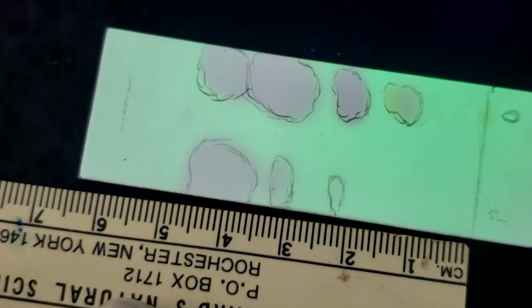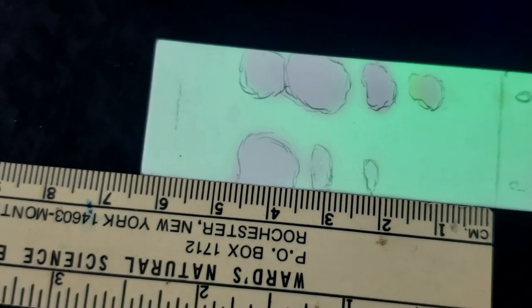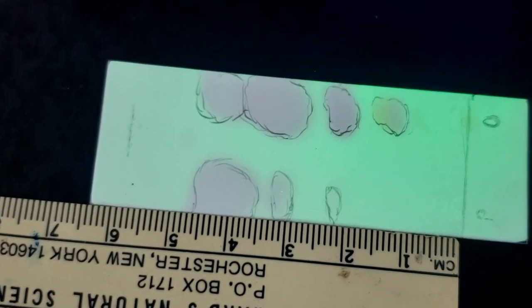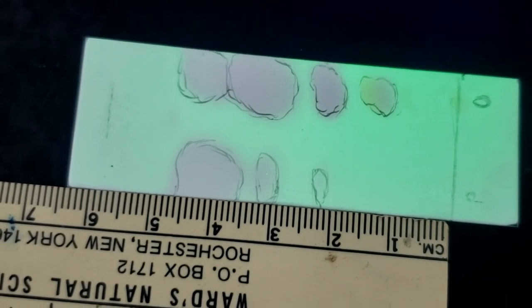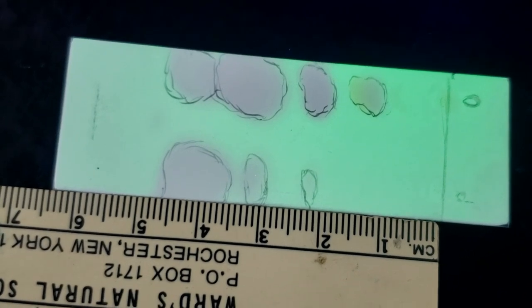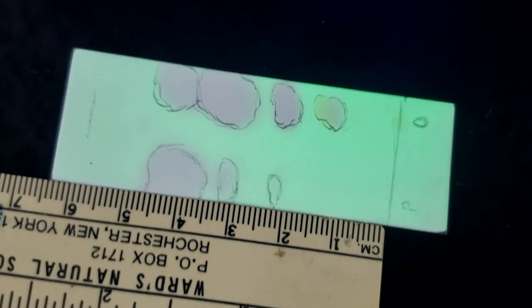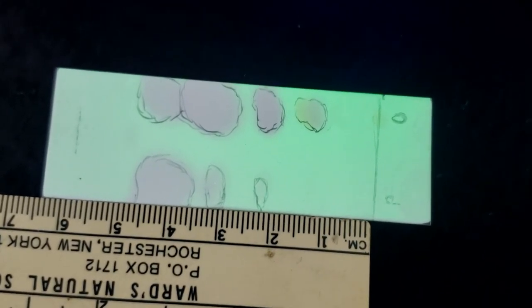Just to take my ruler so you can get some idea of the distance it traveled. So we started, full distance traveled is about 6 centimeters. And I'll go ahead and measure each of those spots so you can collect and calculate the data for the Rf.